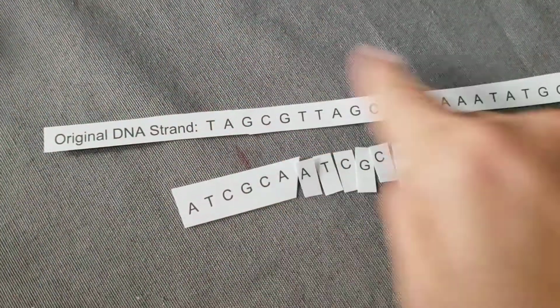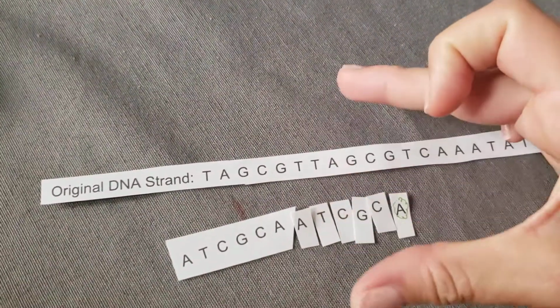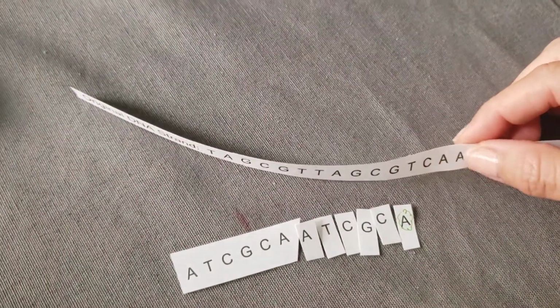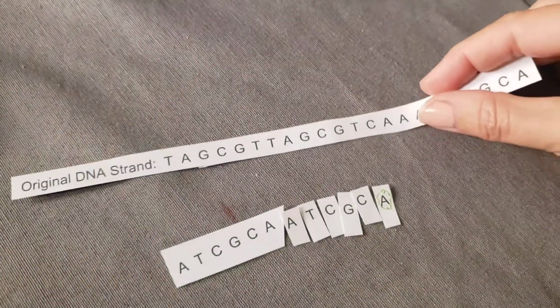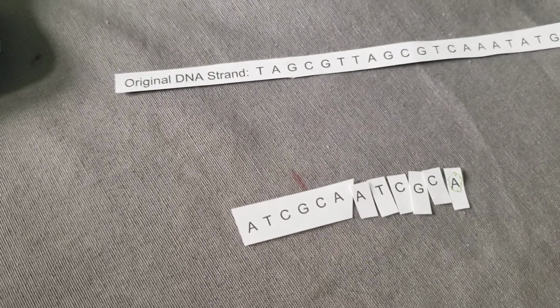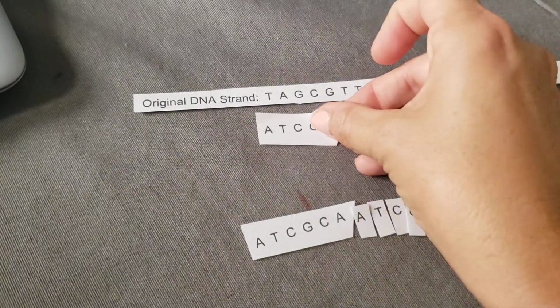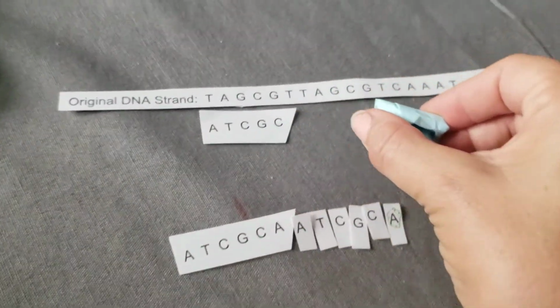So this strand got truncated, but now this strand is going to become separated when the temperature is heated up. So once again, these two will denature, get pulled apart from one another, and now the process starts over. The primers that are available in the mix will come on over and attach, and then the remainder of the strand is going to be built by the DNA polymerase.